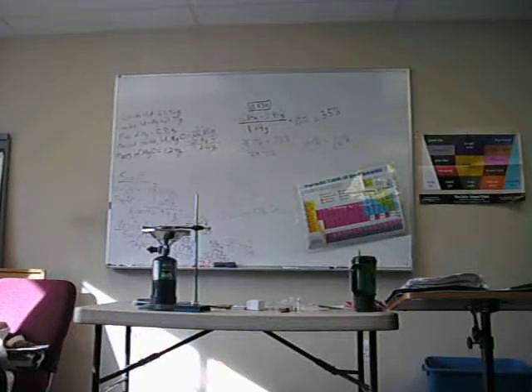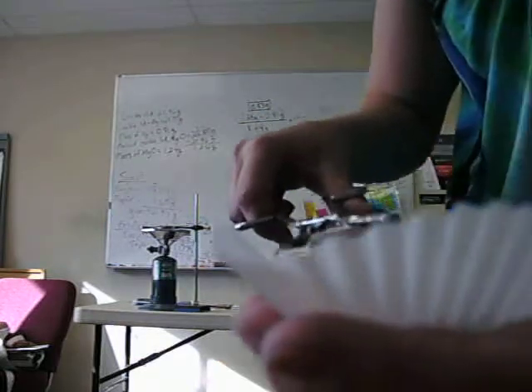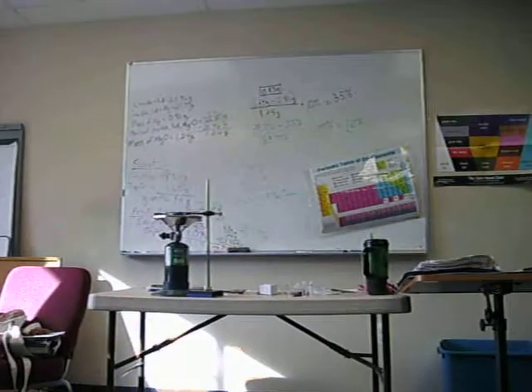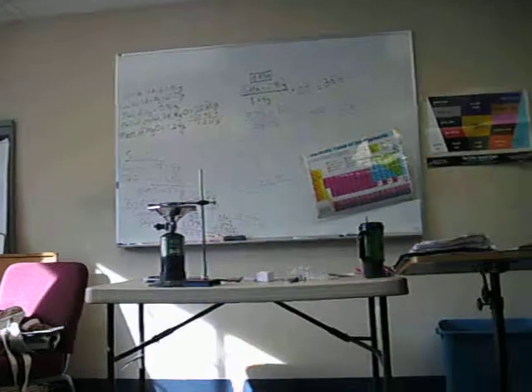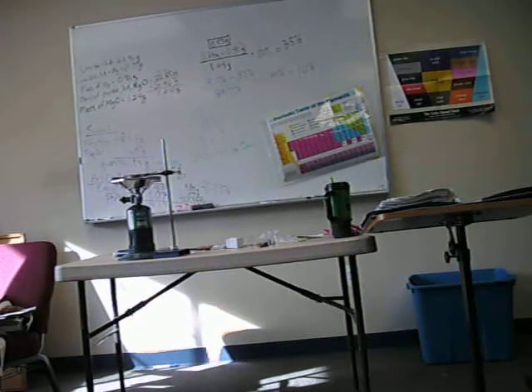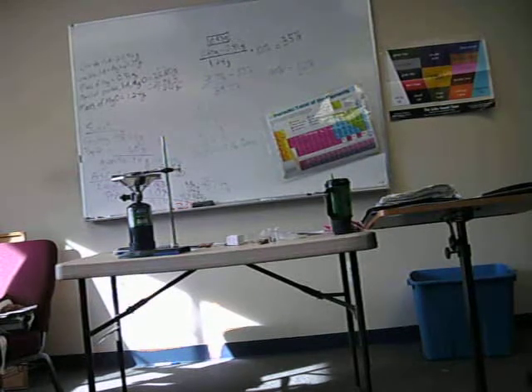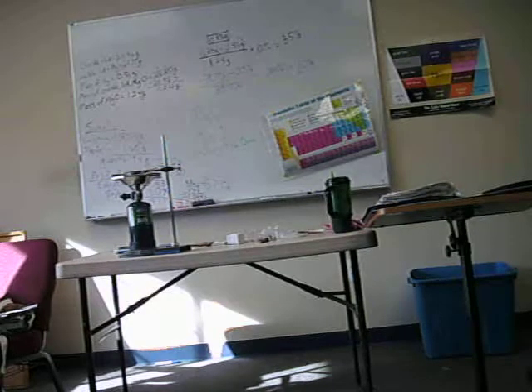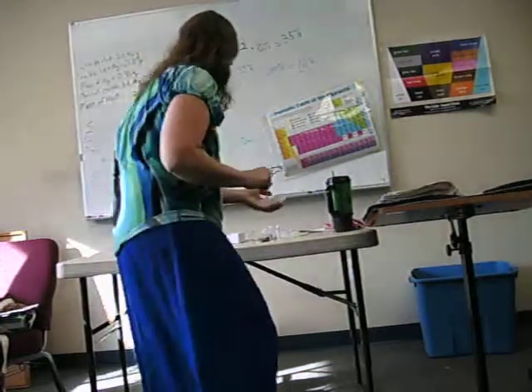But then these pieces right here, is the camera running? There are some pieces of metal that didn't react and aren't that crumbly, that were on the edges or in the center, like that right there. Like this chunk right here, I can't crush, so it didn't get reacted, I think. Everything else is very safe magnesium oxide, now that it's not hot, of course. So, there are definitely some little chunks of metal right there that didn't react. And that's where most of our error is coming from, I think.